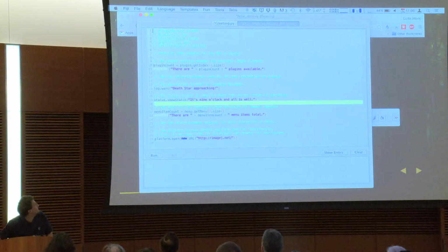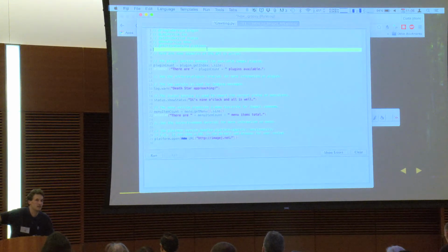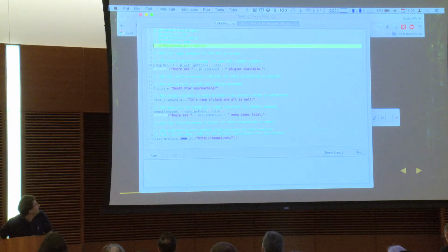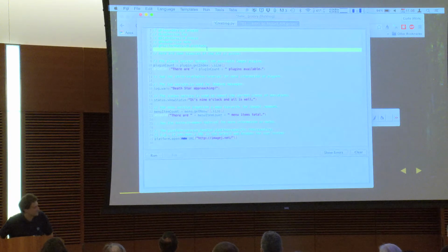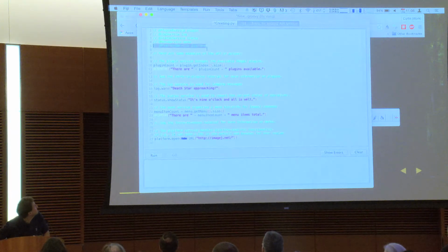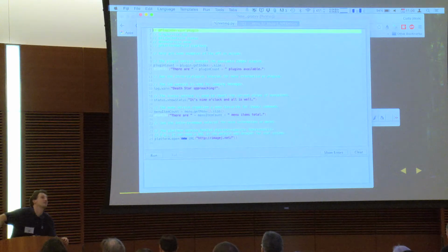For those of you who aren't familiar at all with the design, you can think of ImageJ2 as just a big collection of these things called services. And each service is a collection of routines that do related things. In ImageJ1, there was one class that essentially had the lion's share of the functionality, and this is IJ. So you've probably seen IJ dot do a thing. This is convenient because you can look through the list of what it can do, but it's less extensible. The nice thing about the service paradigm is you can make up your own service. I can make a Curtis service, and then it'll be available if I write @Curtis service Curtis, and then I can start typing Curtis dot this or that. So in the interest of extensibility, it's service driven.